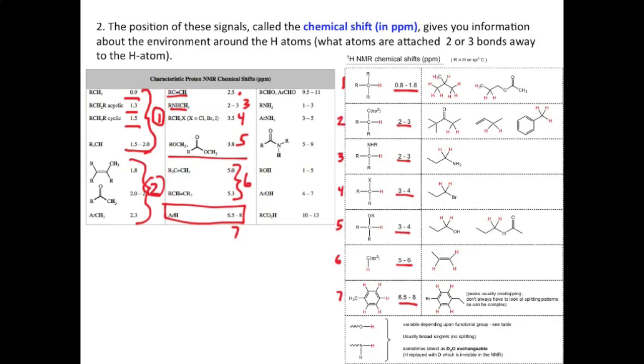Final thing, looking at our table, if I'm looking at a hydrogen of an aldehyde, that can have a range of 9.5 to 11. I have left that off my table. Again, it's something you should be aware of. It's not as common. We're looking at the H of an aldehyde. Finally, what I want to do is talk about the whole next set here, because these are different. I'm marking these in green. Now we're talking about hydrogens connected to heteroatoms. H to an N, H to N.